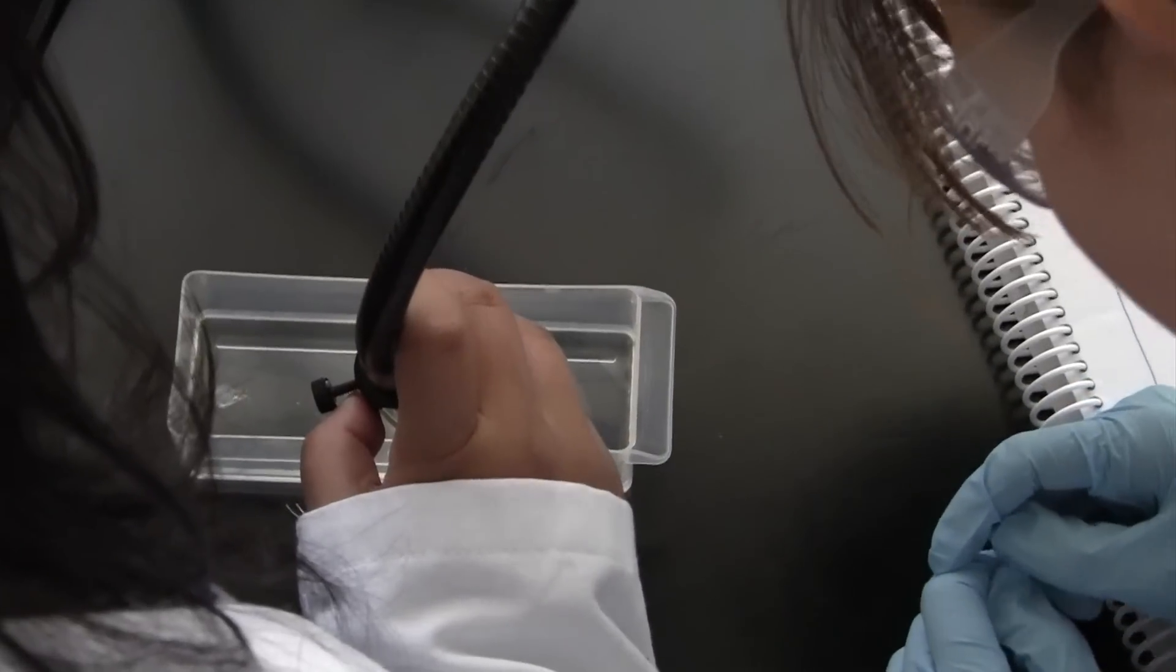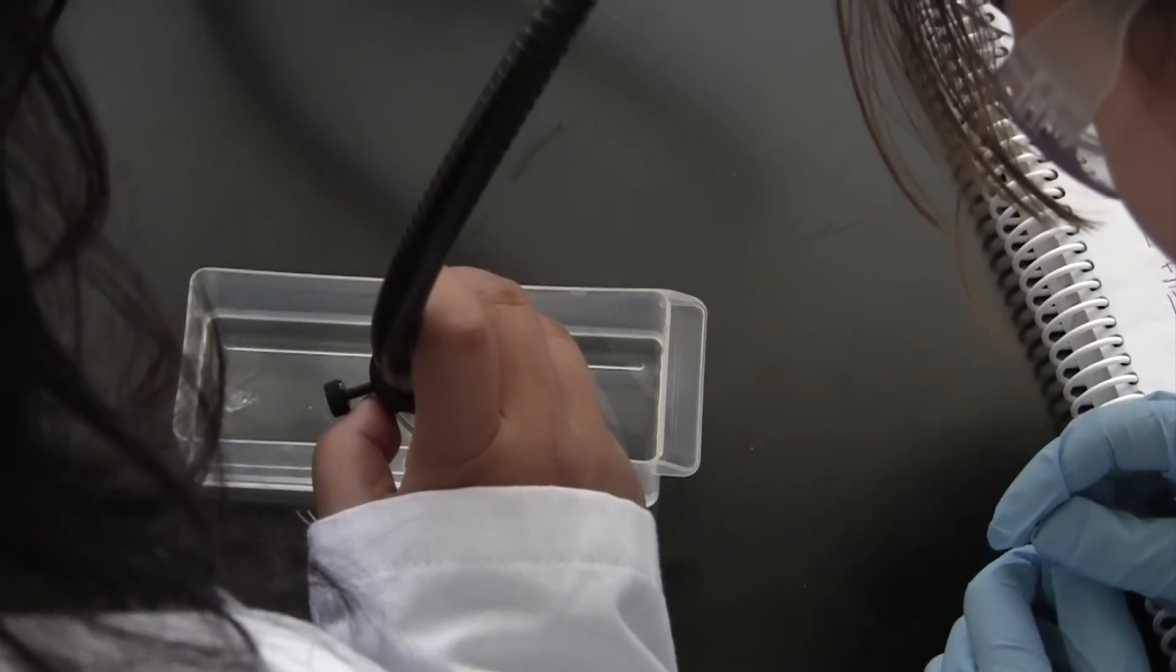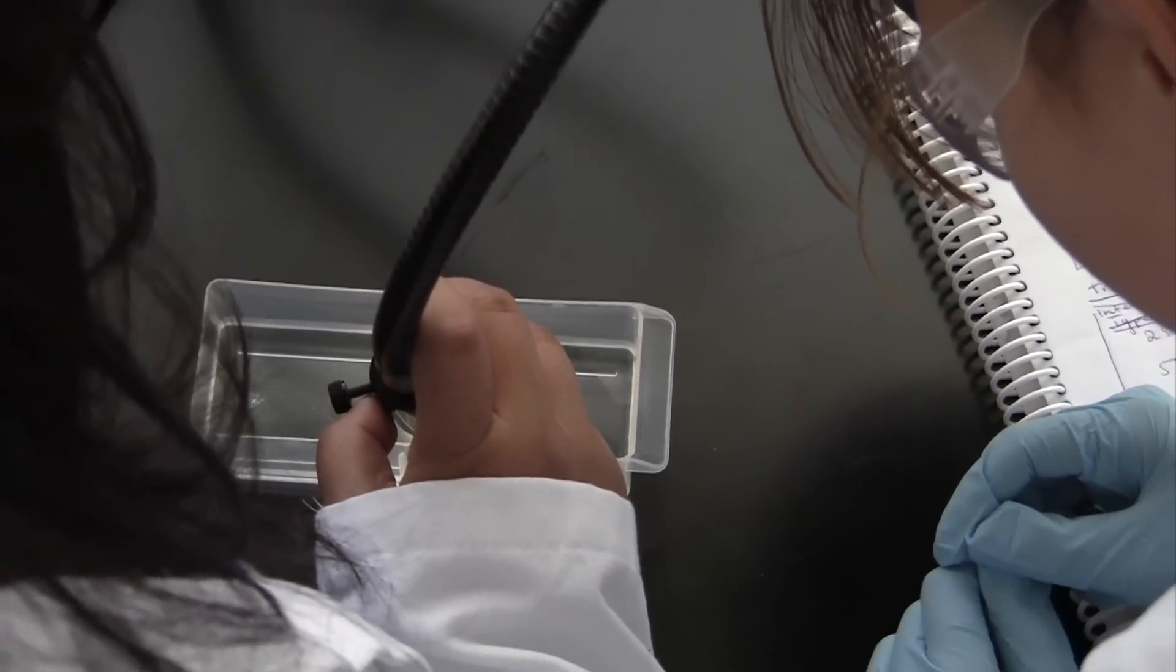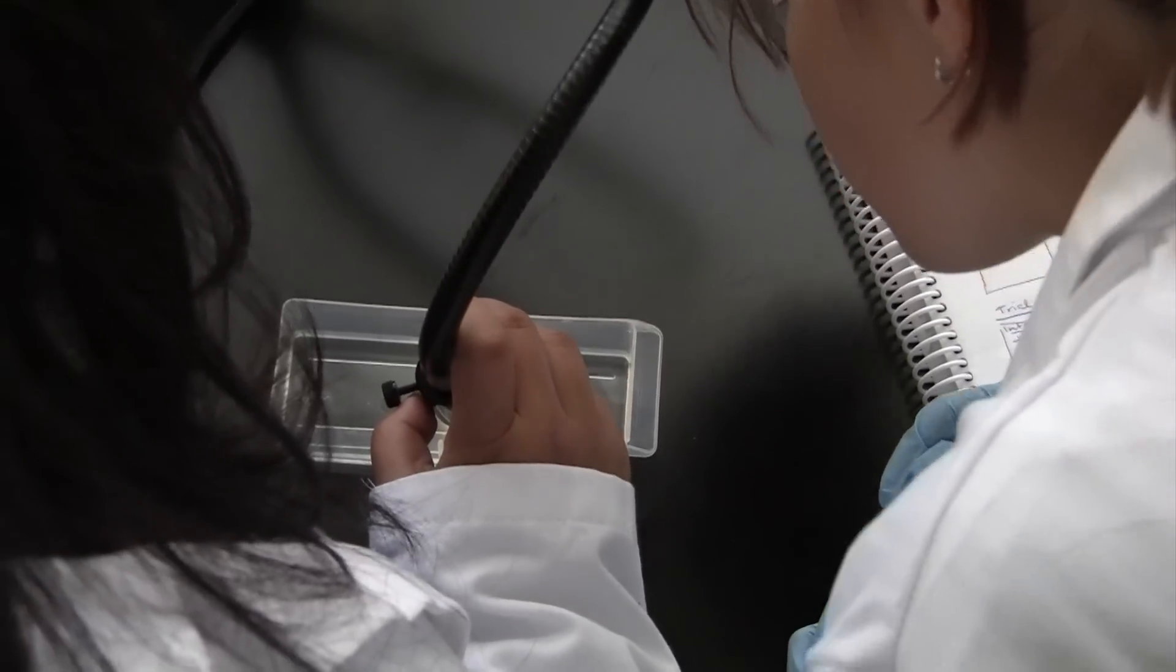Next week the students have two options to either use the idea that they came up with this week, or they can modify their experiment and go with what they learned about the brine shrimp.